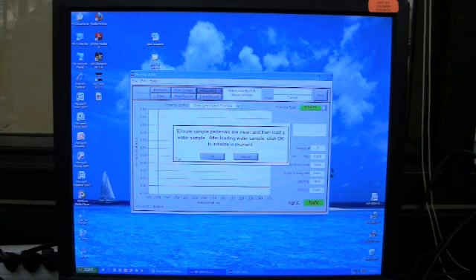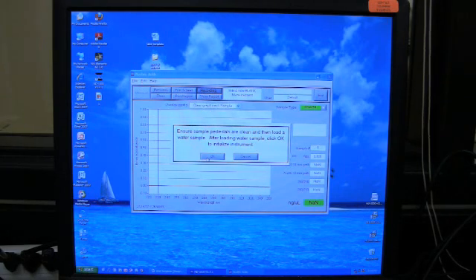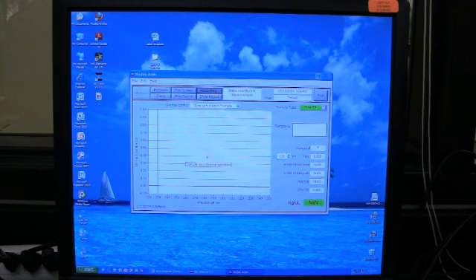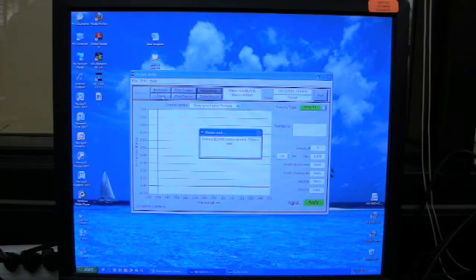After booting up the software and clicking on the nucleic acids button, a control panel with a grid will appear on the screen, followed shortly after by a prompt directing you to load a water sample onto the lower pedestal for the purpose of initializing the machine. Having completed this, click OK. The machine will emit a clicking noise during this process. This is the sound of the sampling arm moving down and coming into contact with the lower pedestal. This is normal and necessary for the Nanodrop to function as it facilitates the bridging of your sample between the two pedestals. Once this primary initialization is finished, the Nanodrop will require a second. Just find the button in the upper left corner of the control panel labeled blank and click it.